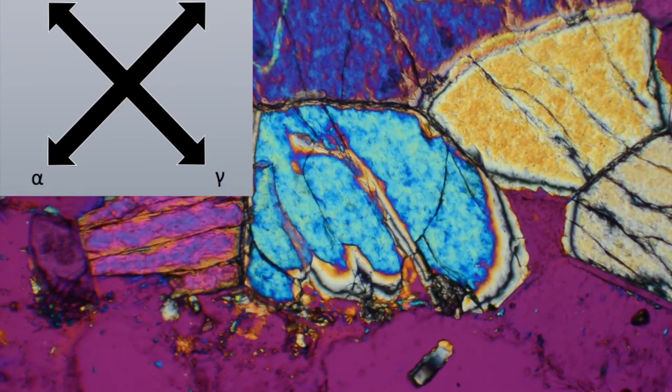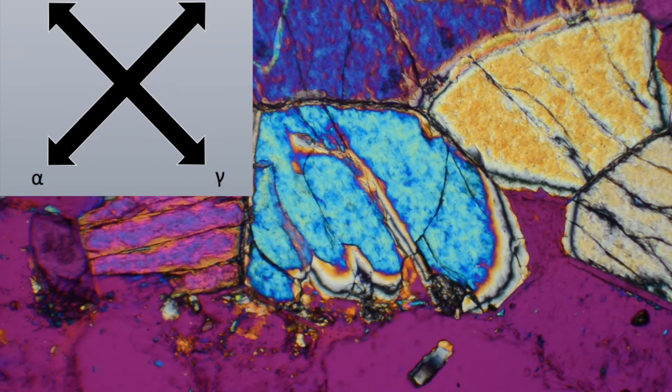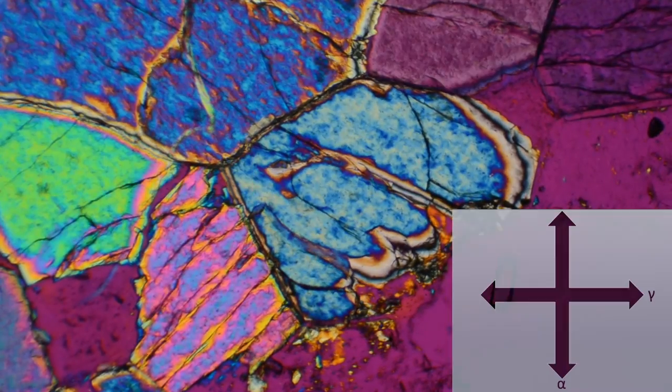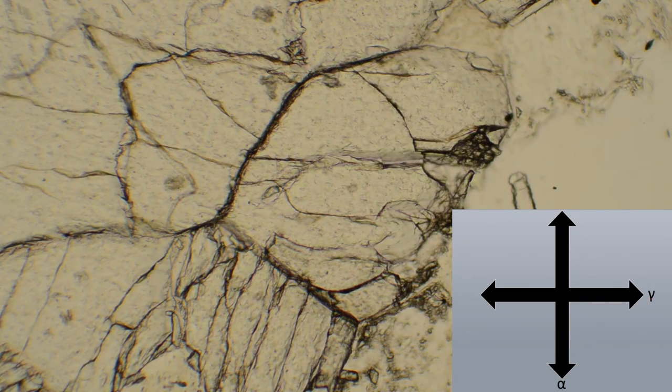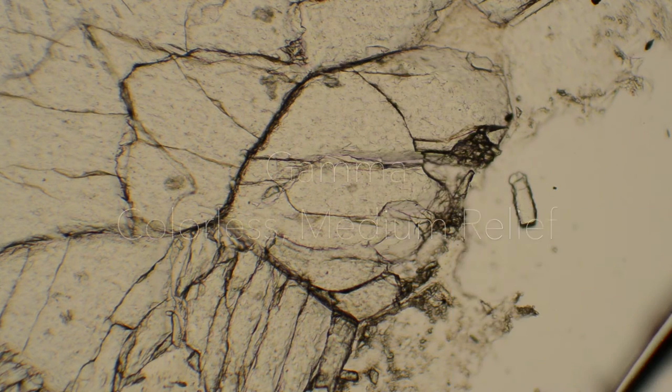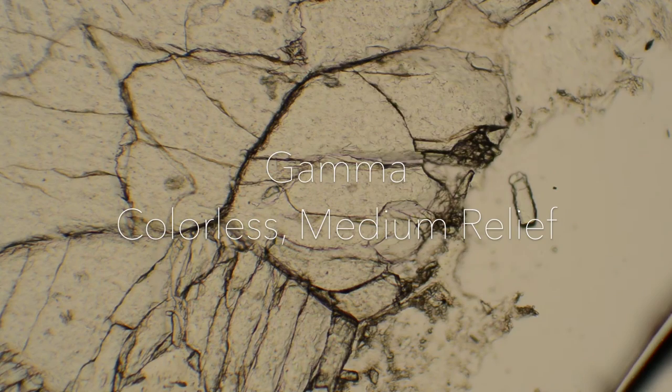In order to align gamma with the lower polarizer, I rotate my stage 45 degrees counterclockwise to the extinction position, then I take out my accessory plate and my cross polarizer. And without moving the stage, I can characterize my grain along gamma in plain polarized light. Here it is colorless with medium relief.